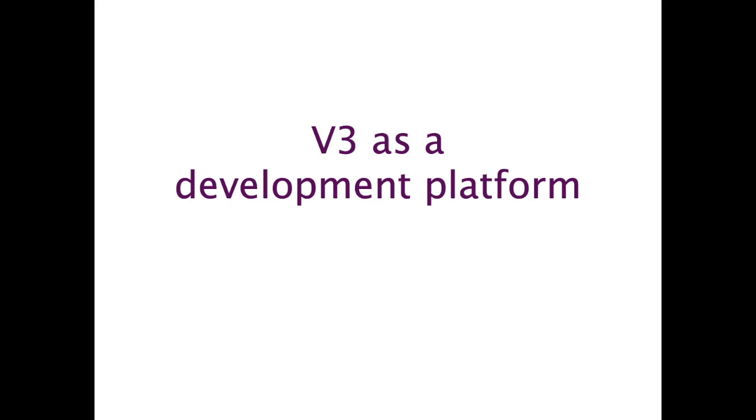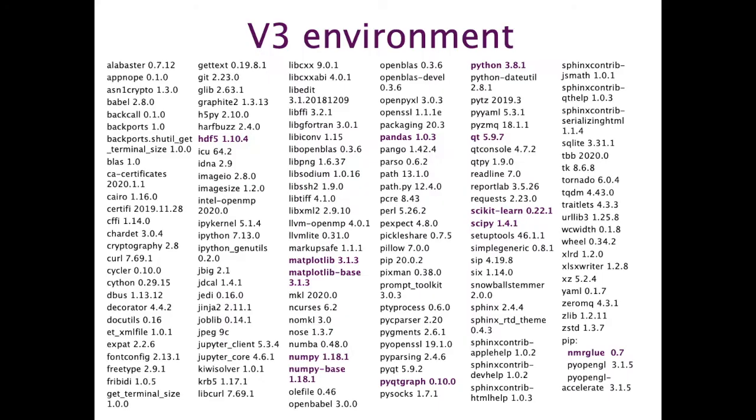So as well as providing all the methods and properties that we've written, that I've just been talking about, we also provide a whole load of packages that have been written by other people with a whole load of methods in them that you can use and access. So this is the full list, I think from version 3.01 of packages that are included. We've now added 1 or 2 extra ones for 3.02. I won't go through them all, but just highlight a few.